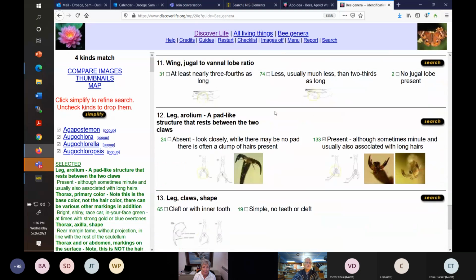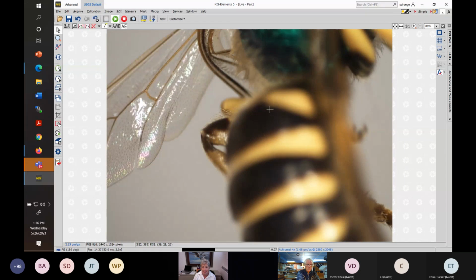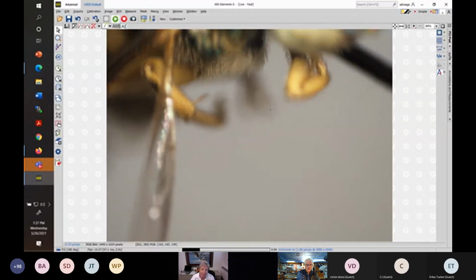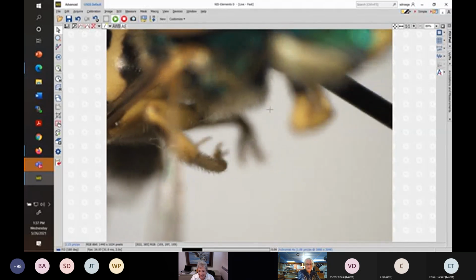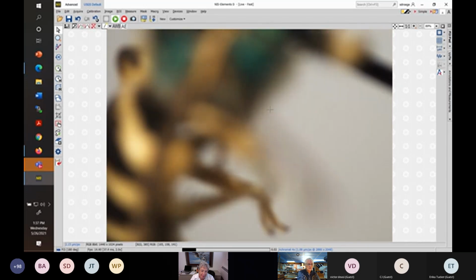But again, back to the microscope screen and actually show it. I'll show it. Yeah, good idea. All right, here's the microscope, and we will. So often, what you'd have to do is get a foot. That's not a good technical term. A leg in silhouette.